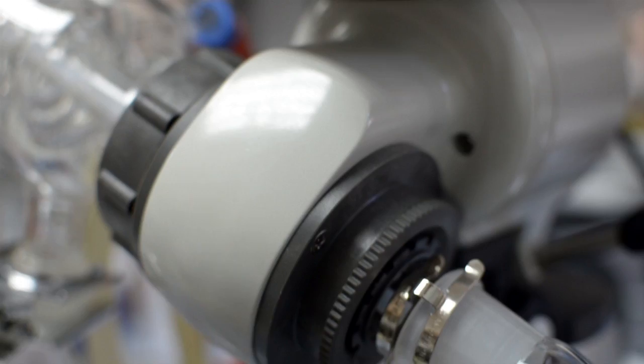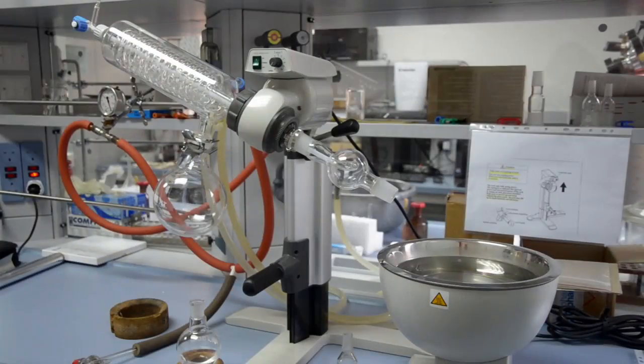The Rotary Motor. This creates the rotary action of the reaction flask.